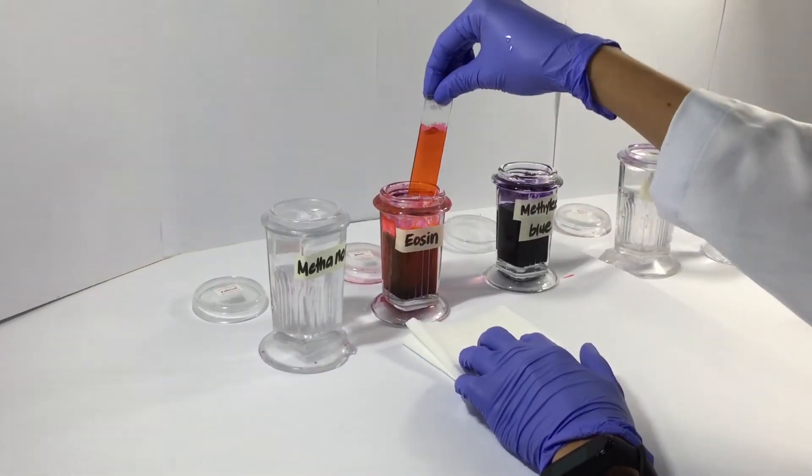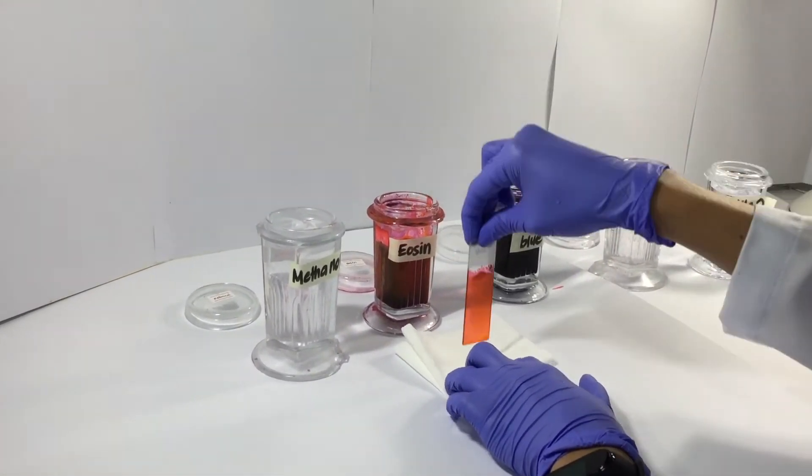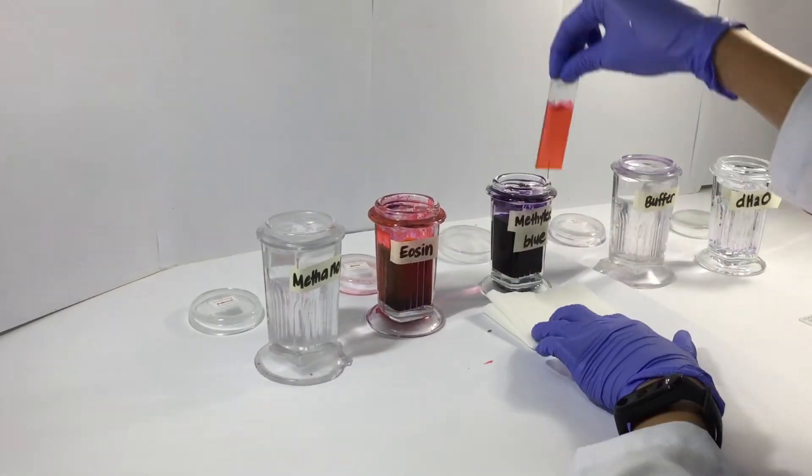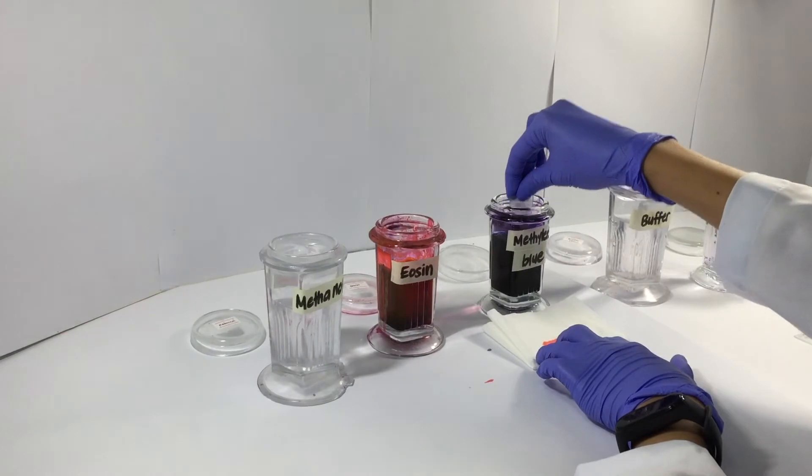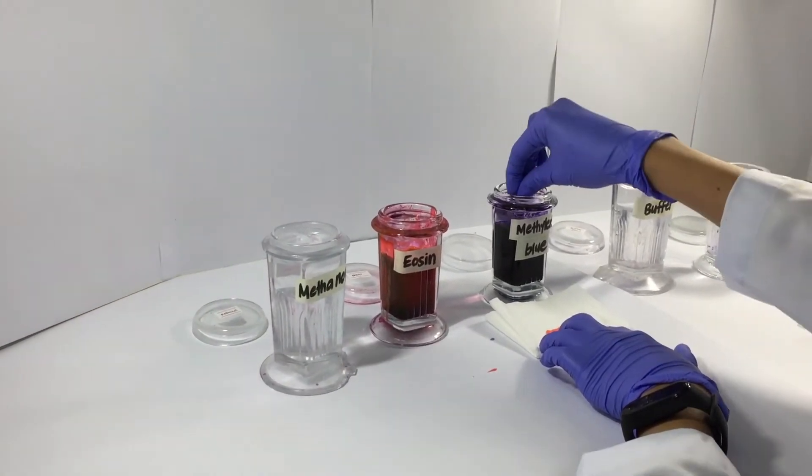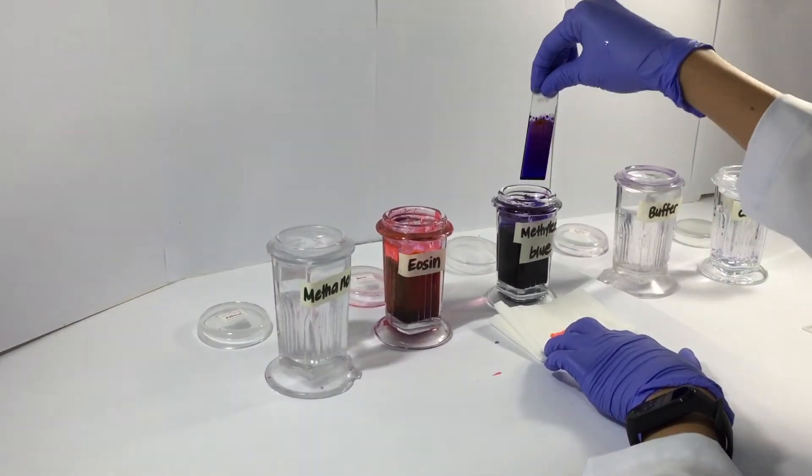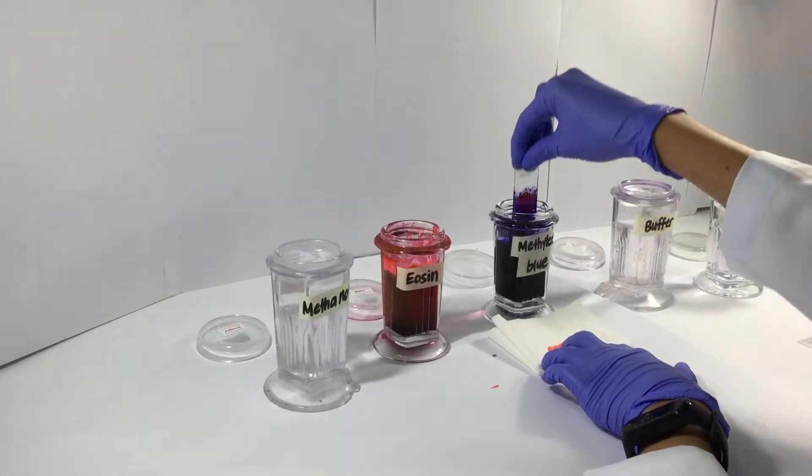Make sure that when you dip it to the next stain, you drain it with a piece of tissue paper to prevent carryover of stains. Dip the fixed slide into the eosin stain for about 6 seconds, then into the second stain, which is the methylene blue for about 4 seconds.